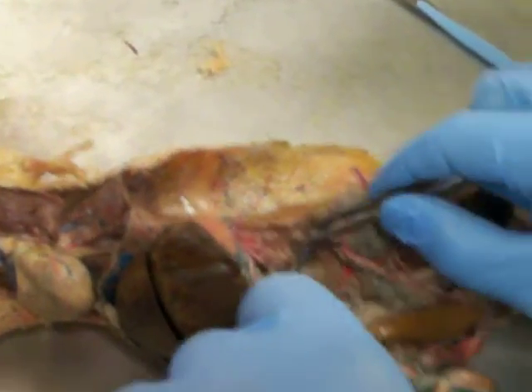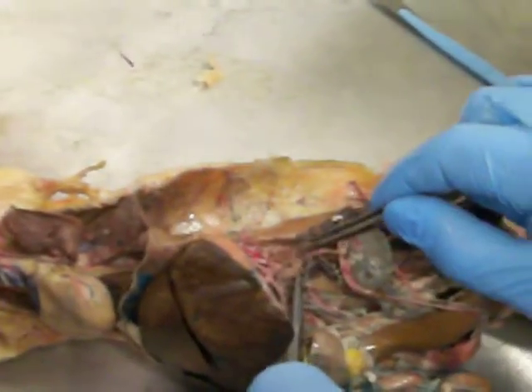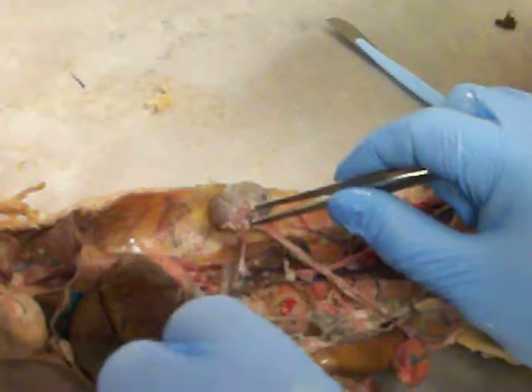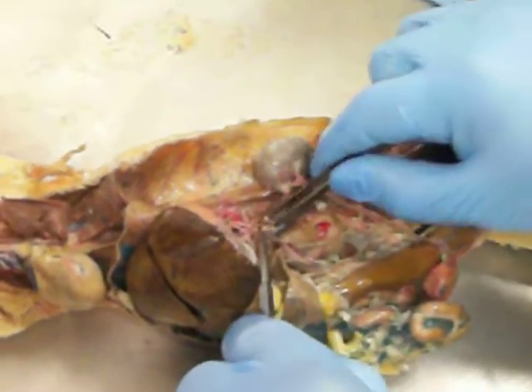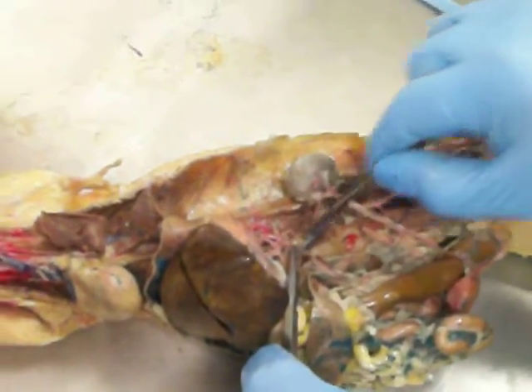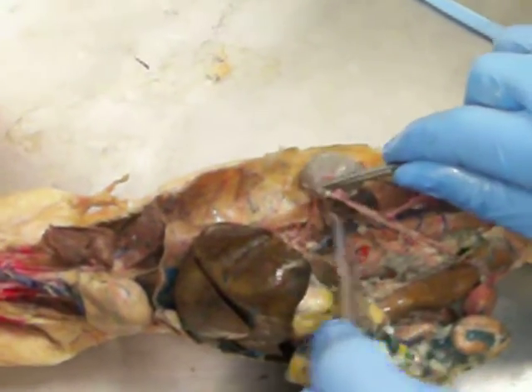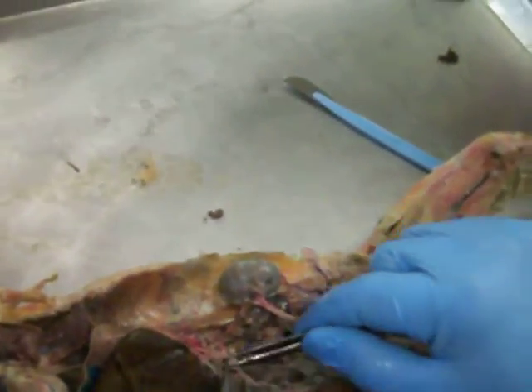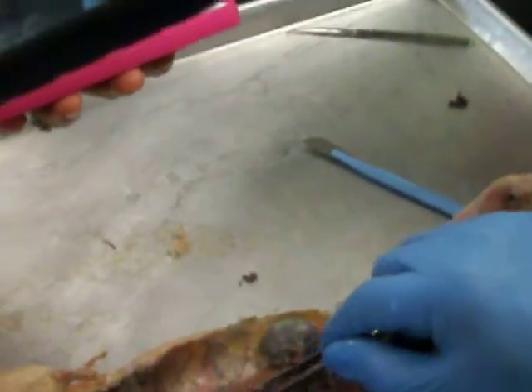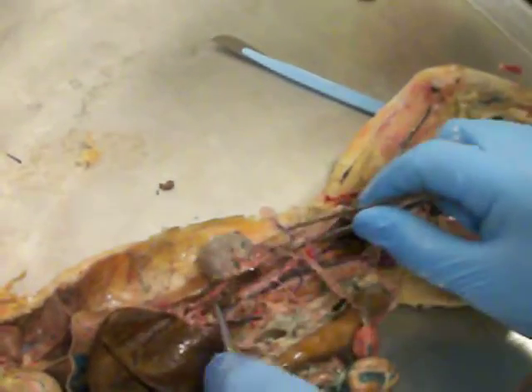Alright, next we have the descending abdominal aorta again, and it branches into the renal artery and vein. And so here's our renal artery going to the kidney. This is our kidney. And we've also got the adrenal lumbar artery and vein in here. They're not too clear on this cat. That's a vein.